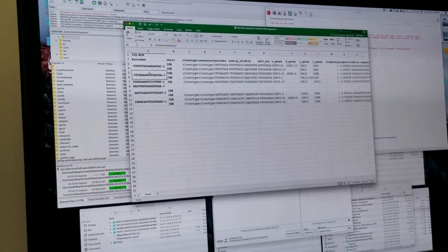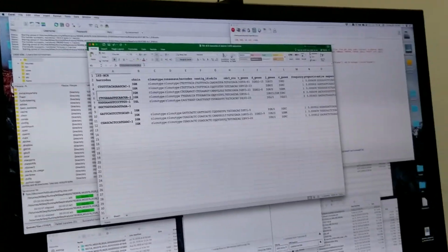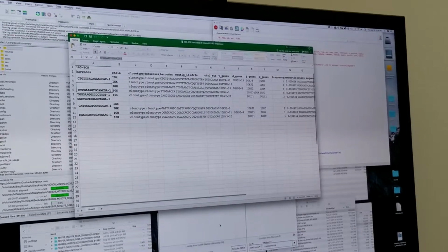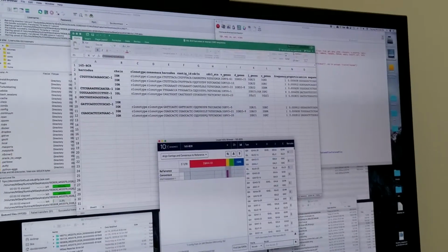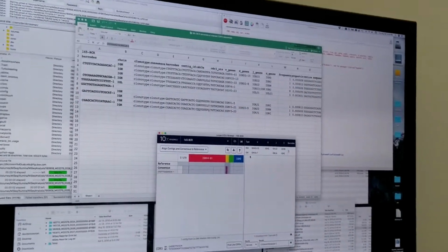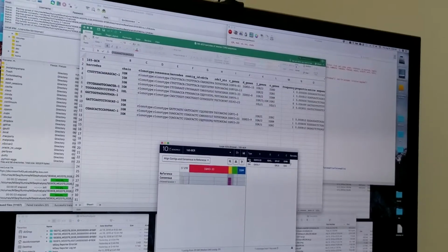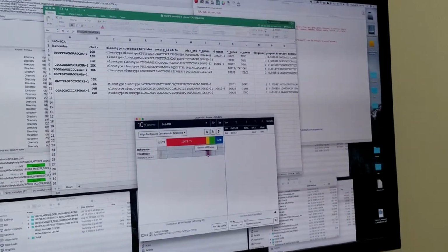Now, can you look at another heavy chain and see if it also looks like it might not be right? I mean, this is new territory. I think, for the next barcode, the one that you had listed in number 2. Fortunately, we don't have a shortage of sequence cells. Okay, so here's the heavy and kappa. If I click on the heavy, again, you've got a large deletion of 29 bases there in that region.